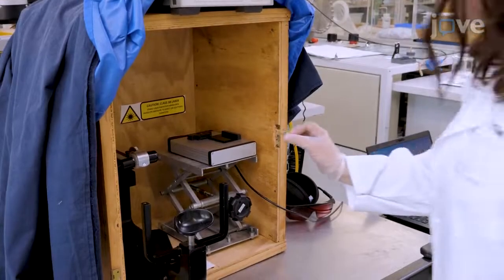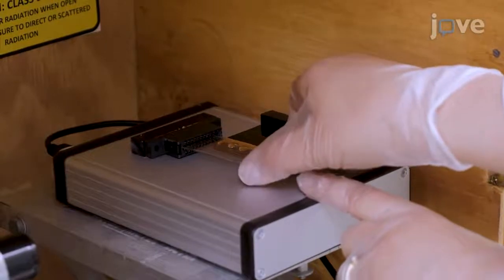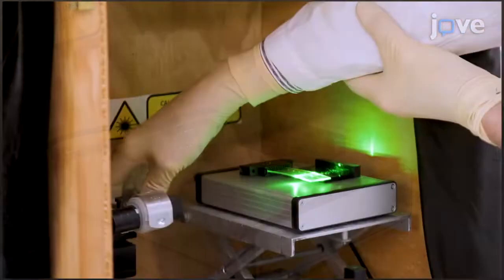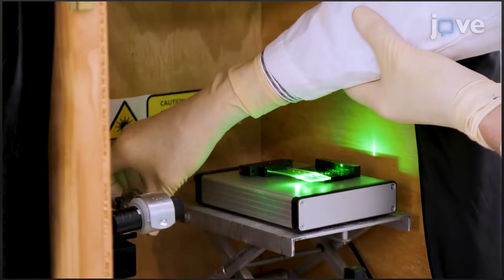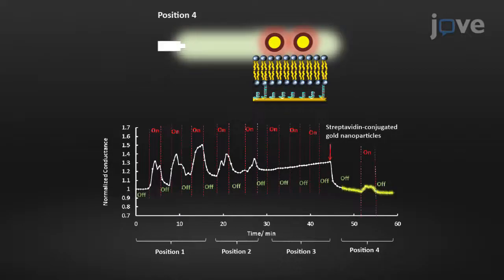This protocol offers a nanomaterial electrode interface that mimics natural cell membranes, making it possible to determine the effect of localized heat transfer from irradiated gold nanoparticles on the integrity of a biological membrane. The nanoparticle and photothermal effects can be explored in real time on model cell membranes.